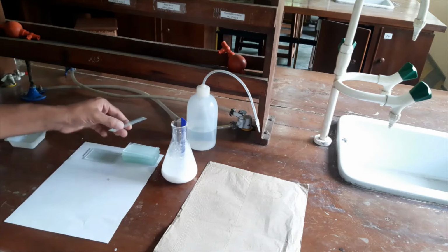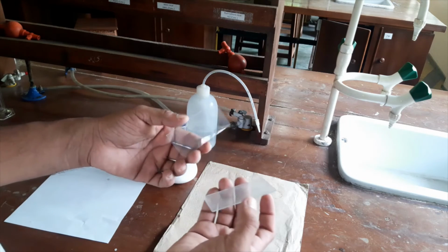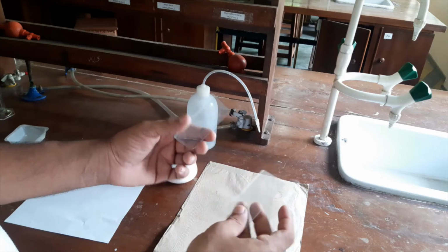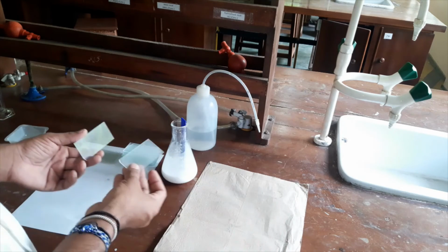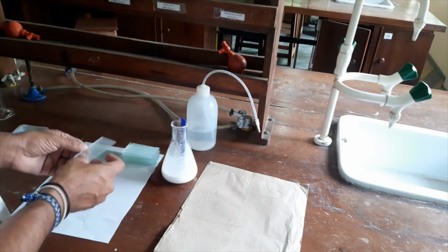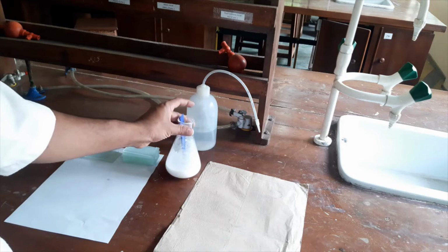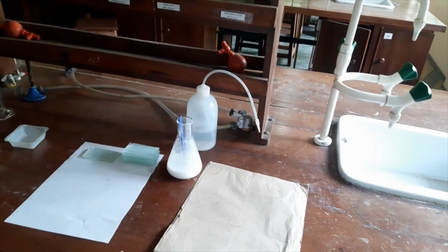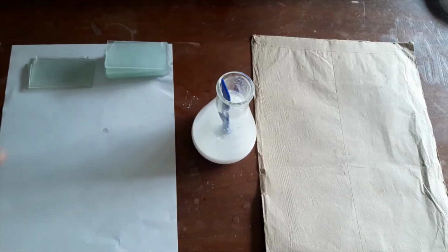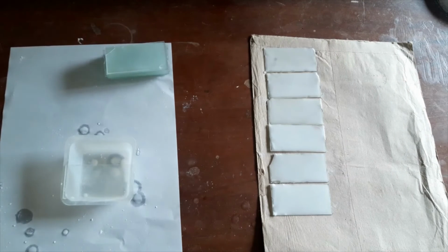Now we have these cover glass plates, actually glass slides. We will spread 1 or 2 spatulas of this paste on these silica gel plates. Okay, let's look very closely. Let's take one. I have prepared 6 TLC plates up to now.